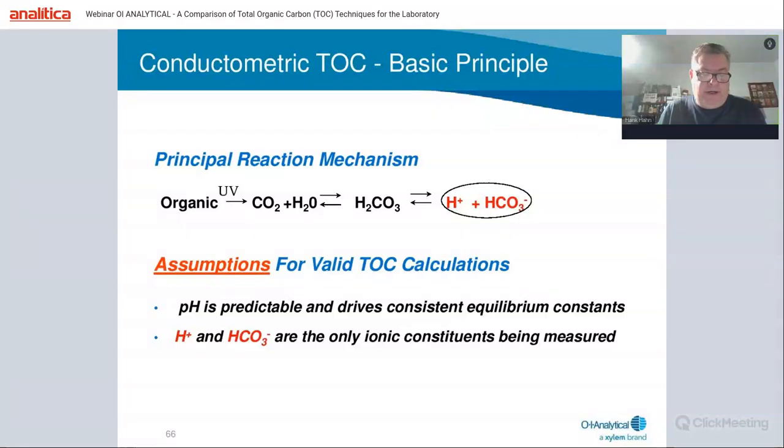The potential for positive interferences due to membrane crossover must also be considered with this technique. Also, there could be issues with samples containing particulates. High turbidity will impact this principle.